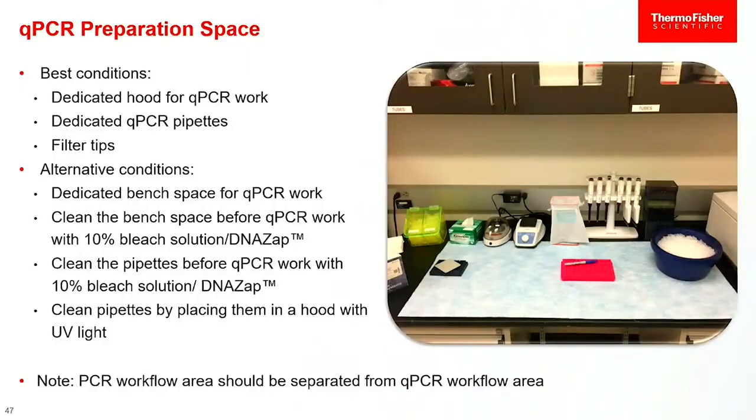Dedicated pipettes, that's an option, not always something you're gonna have here in these labs. Using filtered tips though, I always recommend using filtered tips because remember how pipettes work, we are moving air to pull up volume. If you don't put a barrier between your sample and the inside of that pipette, there is the chance that the air hangs on to some of those DNA molecules, and the next time you use it, you're putting it in the next space. So really, use the filtered tips.